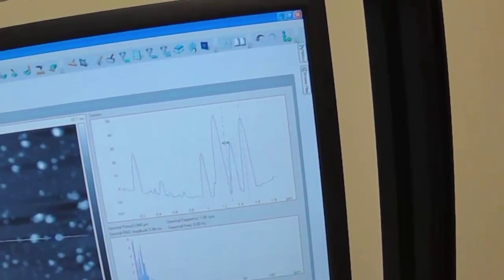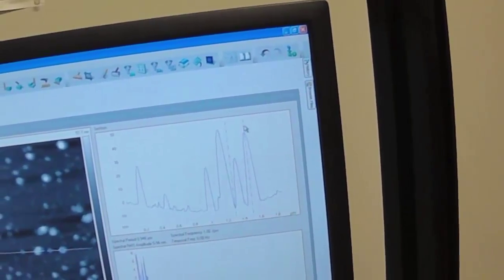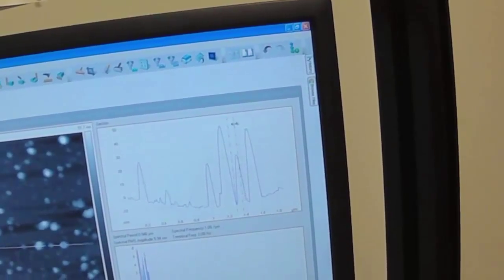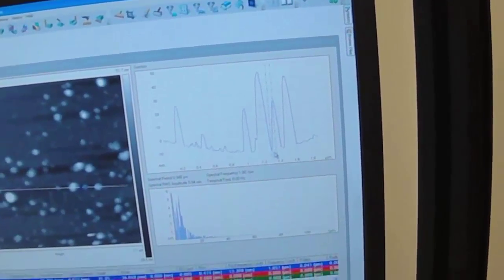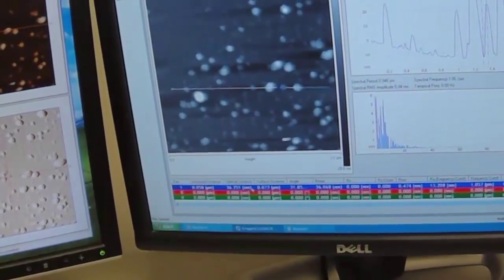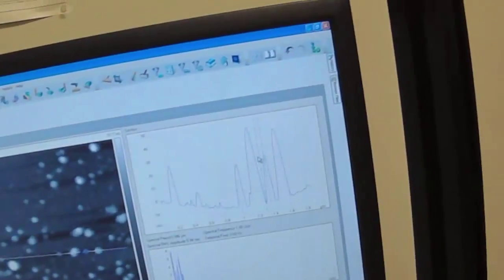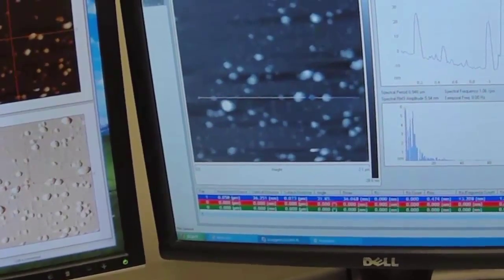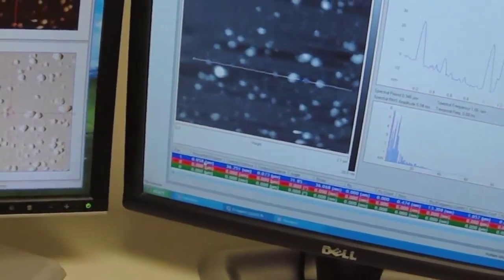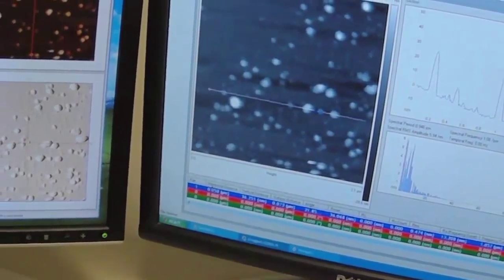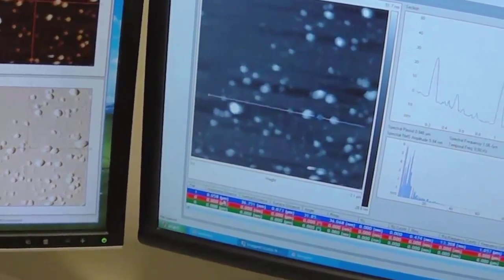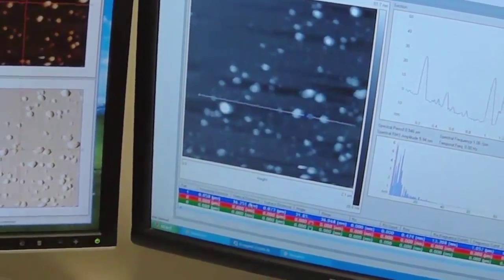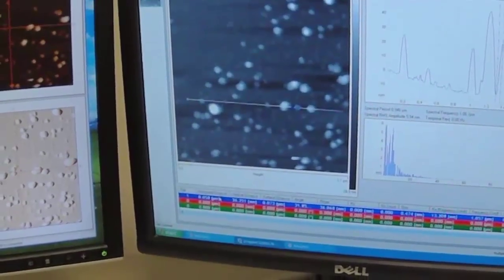Now from this one cross section, I could then also measure this peak. So the height of this peak is now 36 nanometers and note that. You could also note the horizontal distance because in your post lab there's a question: why is this number in micrometers larger than this number in nanometers? There's a reason why these are given in micrometers because this is going to be a larger number. And why is that?